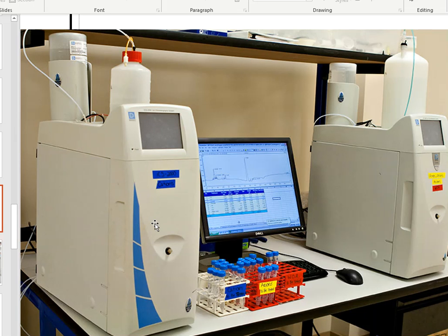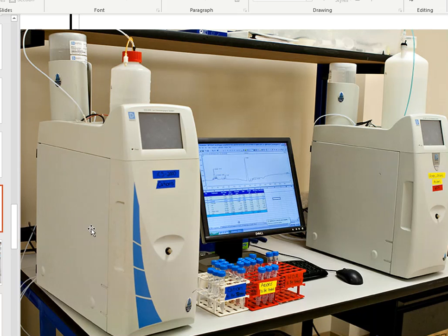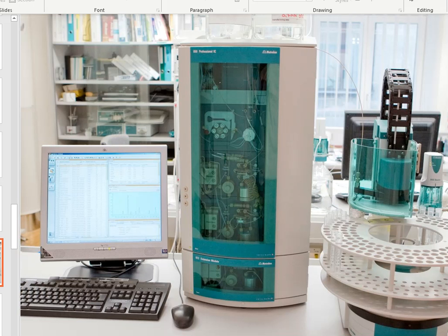Maybe not the most current, but you can kind of see the progression from what it was, which is here, to what it is now, a little bit closer at least, to this picture here. We do not use a Dionex, and we have chosen Metrohm instead. The reason that we've chosen Metrohm is because a lot of local laboratories use Metrohm and not Dionex, and the Metrohm units look something like this.